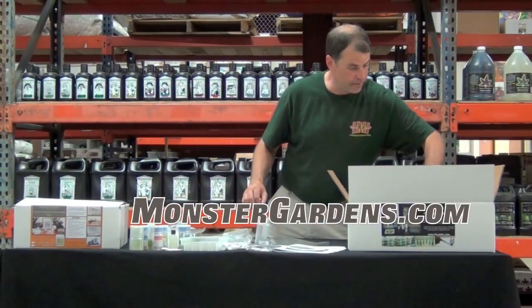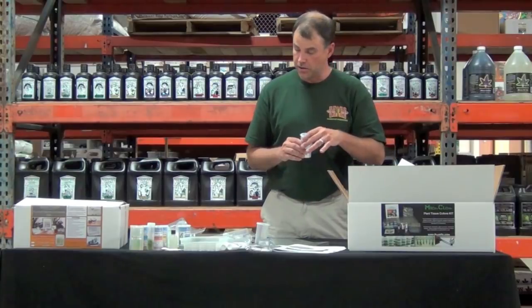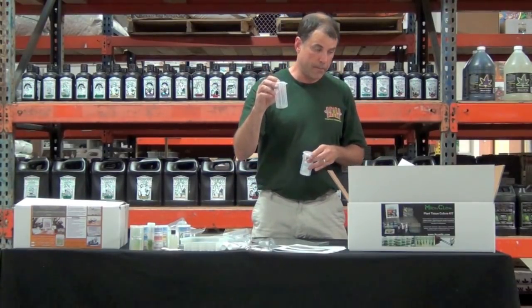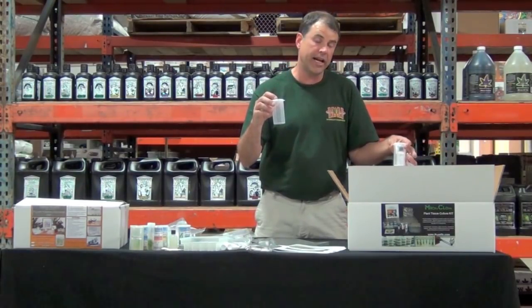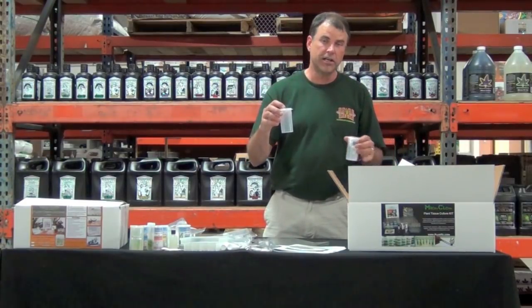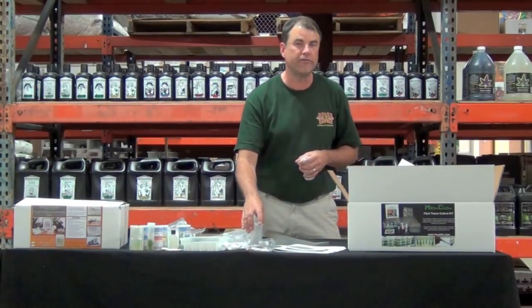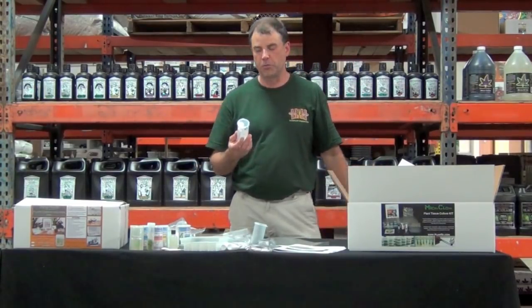The one other item in the kit I wanted to show you is that the bottles also come in a perfect 10 by 20 polypropylene skeleton tray, which is very handy for holding all 50 of the vessels. They perfectly fit four to an ordinary baker's rack, which is my favorite shelf for lighting and growing the tissue culture plants.